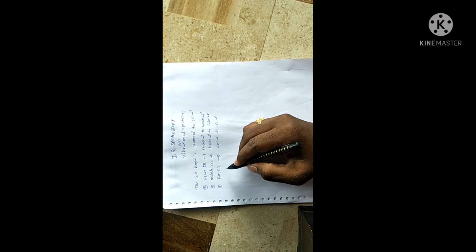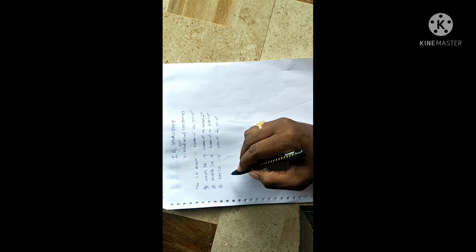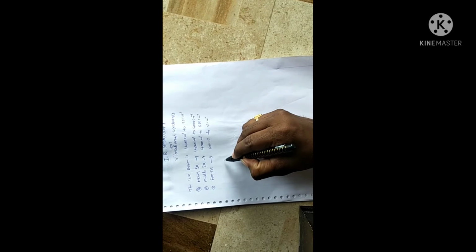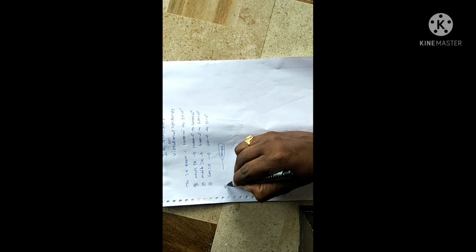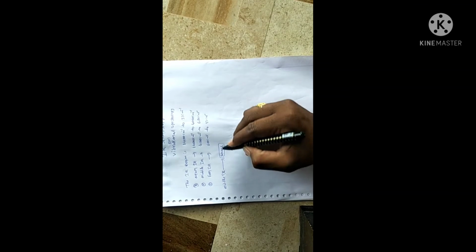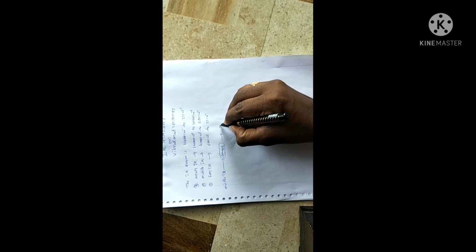Of this total IR region, the middle IR region is sufficient for IR spectroscopy. When a sample is irradiated with the middle IR, it produces this IR spectrum.